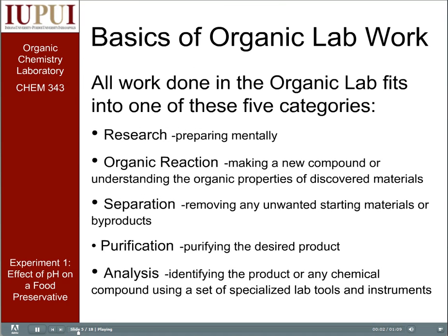So now we really get down to sorting out and organizing organic chemistry lab work for you. Since you're just starting this, you probably haven't been through too many labs, Gen Chem and some stuff in high school. But organic lab work can be easily broken down into 5 categories. Everything that you're going to do in the lab is one of these 5 things. So either running the organic reaction, so taking organic chemicals, adding them together, sometimes heating them, sometimes cooling them, so that some reaction takes place.